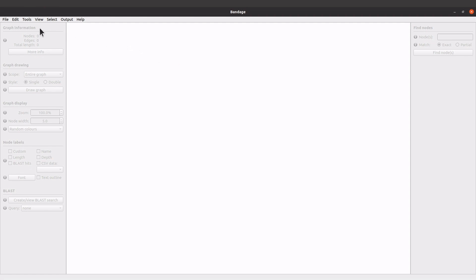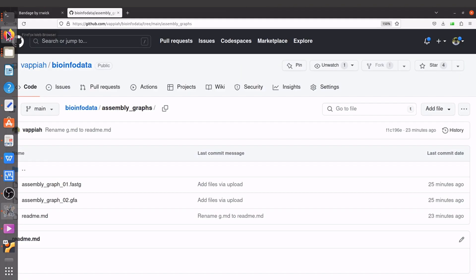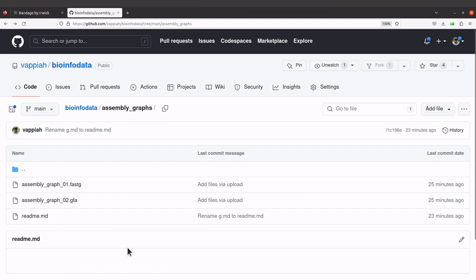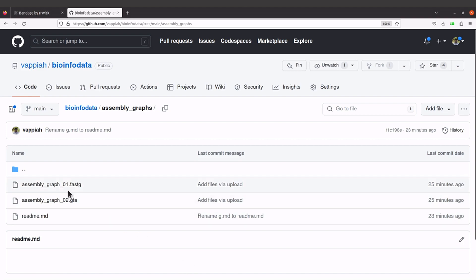This is the repository which has the assembly graphs. By the way, I have tutorials that show how these assembly graphs were generated, so check the description box for those tutorials. They are in my genome assembly playlist. So let's use this first file here.